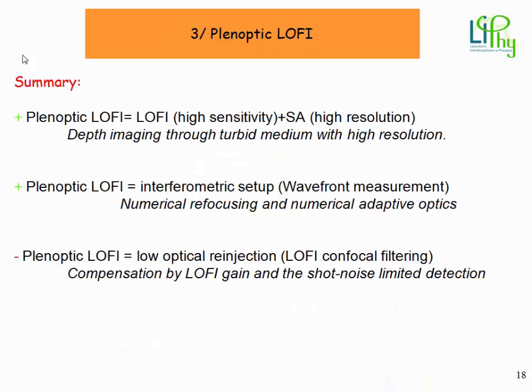So to summarize this talk, I would like to briefly recall the main specific advantages and disadvantages of the Plenoptic LOFI microscope. Firstly, our Plenoptic LOFI microscope allows us to associate the high sensitivity and simplicity of laser optical feedback imaging with the high resolution of synthetic aperture imaging. Therefore, it allows us to obtain in-depth images through turbid medium with a very high resolution, and the resolution is independent of the depth inside the medium.